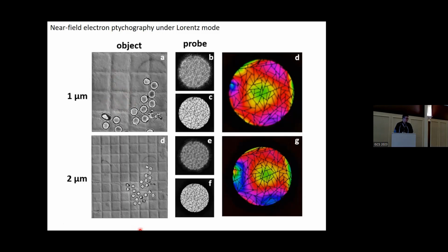Okay, thank you. You also have another question from Jinging Zhao. Very nice talk. Could you give some comment on the pattern you used for the condenser aperture? Why do you use that specific pattern and not something else? Okay. What do I use on what? So for the condenser aperture, why do you use this pattern and not another one? Okay.